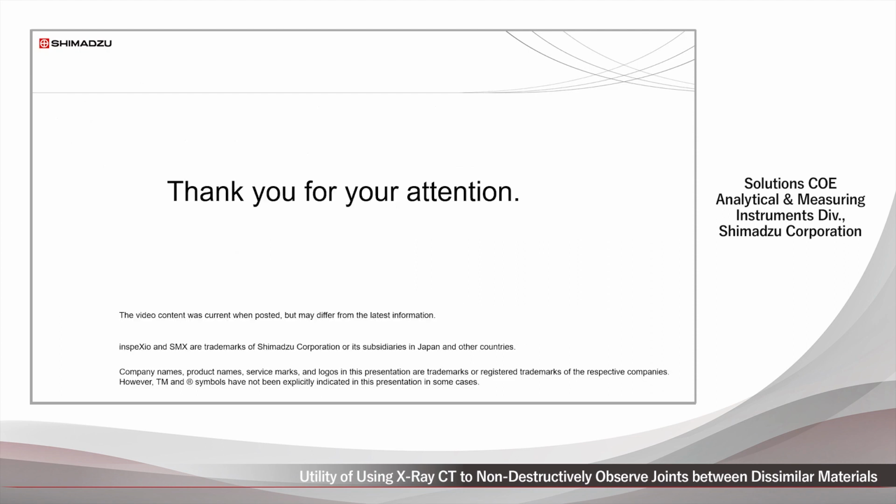This completes my presentation on using X-ray CT imaging to non-destructively observe joints between dissimilar materials.